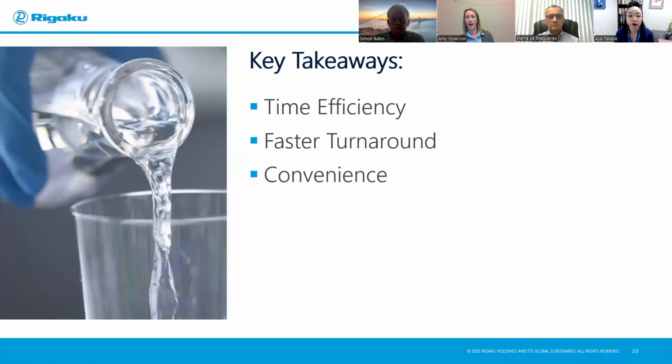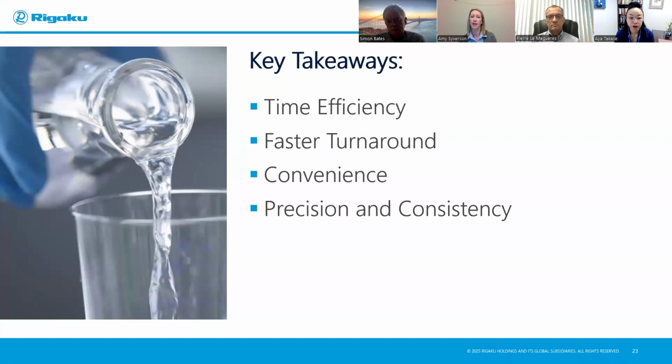In high throughput labs, stock solutions provide immediate access to the materials that are needed, which is essential for maintaining a smooth workflow and ensuring that experiments can go on without having any delays. Solutions that are prepared, stored, and used consistently help ensure that your experiments are more reliable. You have the ready-to-use solutions and remove any variables that may lead to any inconsistencies when you're mixing solutions every time.